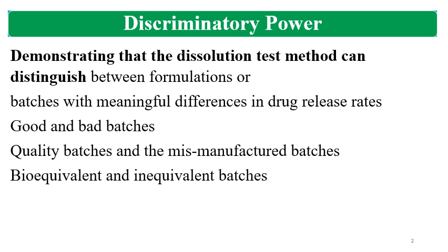So the batches with meaningful differences in the drug release rate should be detected by the dissolution method. The dissolution method should discriminate the quality batches and the mismanufactured batches. In another way, the dissolution method should detect bioequivalent batches and bioinequivalent batches.